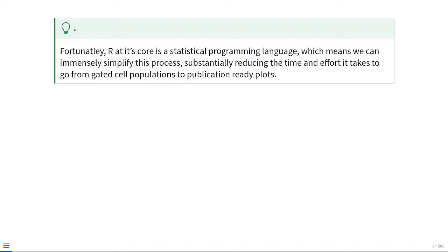So fortunately, R at its very core is a statistical programming language, which means that it immensely simplifies this process and it can allow us to substantially reduce the amount of time and effort it takes to go from having a gated cell population to publication ready plots.